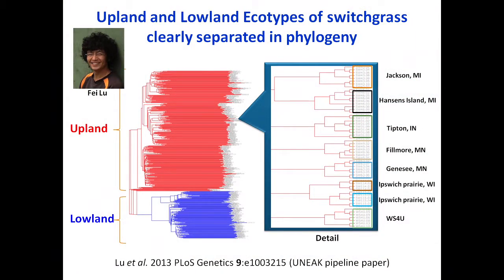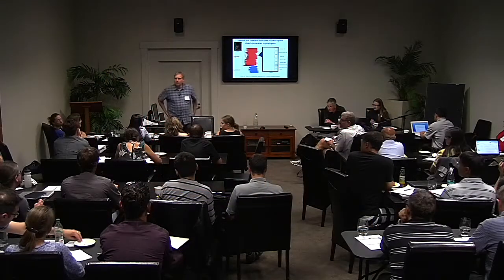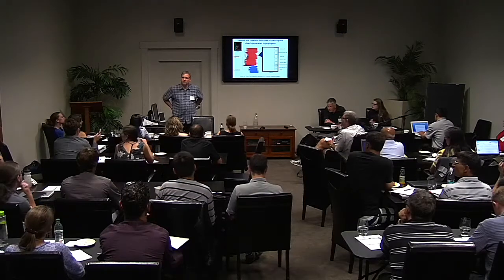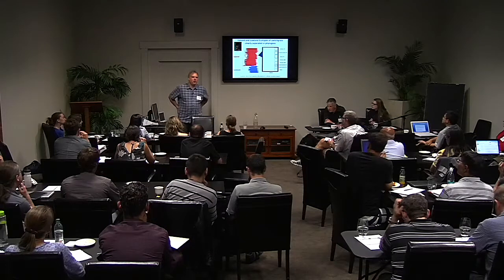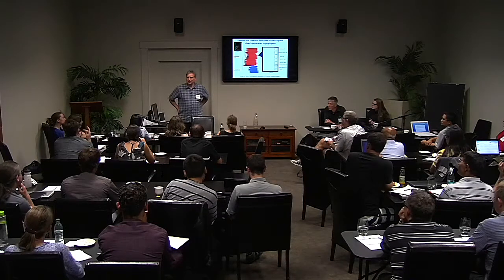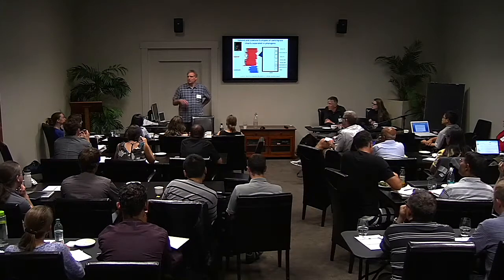Yes. How does he build that phylogeny? Does he concatenate all those markers across all his samples and generate a sort of alignment? Well, you get a genotype file, and he just opens it in Tassel and asks it to calculate genetic distance and make a dendrogram. And then if you wanted, you can import the distance matrix out of Tassel and bring it into other programs and do other things with it. So, any other questions?